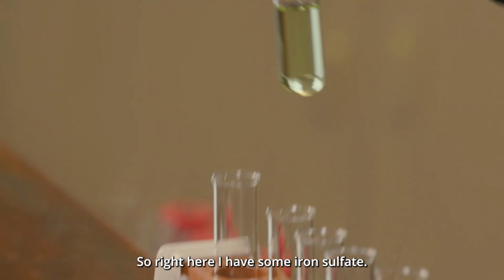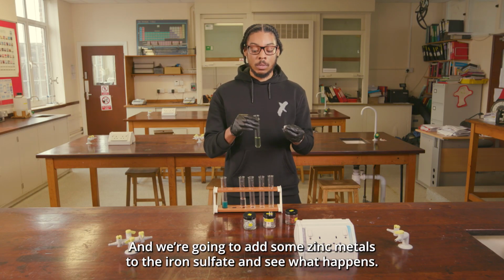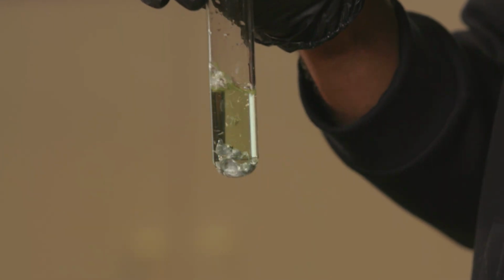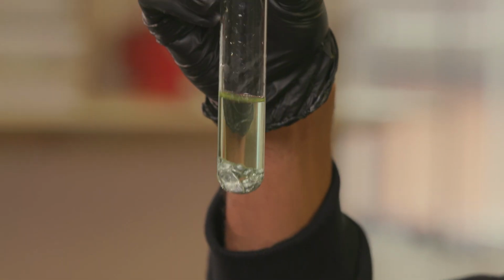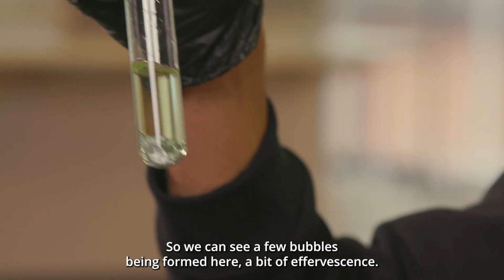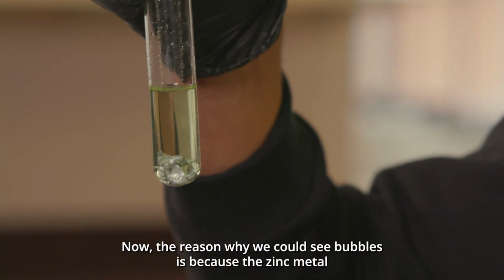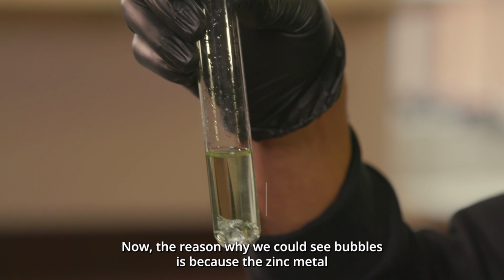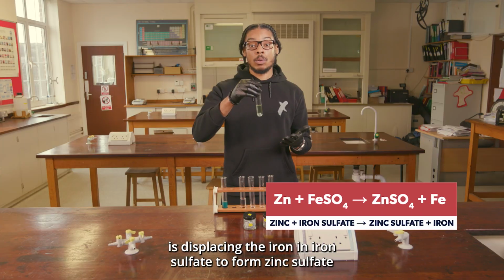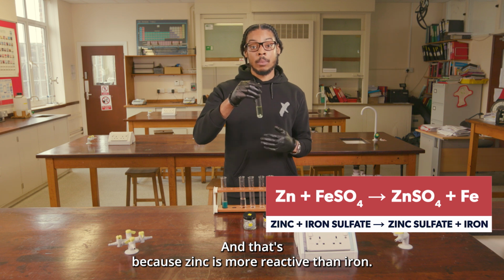Okay, so right here I have some iron sulfate, and we're going to add some zinc metal to the iron sulfate and see what happens. Okay, right, so we can see a few bubbles being formed here, a bit of effervescence. Now the reason why we can see bubbles is because the zinc metal is displacing the iron in iron sulfate to form zinc sulfate, and that's because zinc is more reactive than the iron.